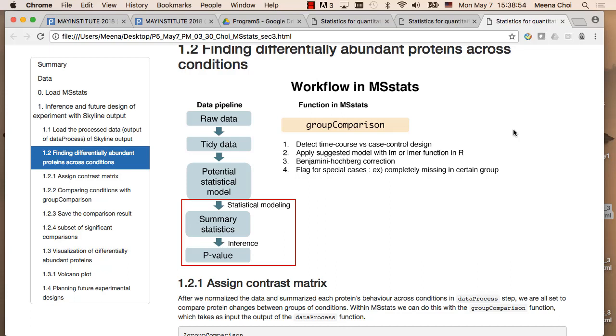So here, we have a condition, and then MSstats says the p-value is 0. We just record 0, which means it looks like something happened, but we cannot give you any statistic number. That is what we say. So we flag this one too. Or special case, no measurement at all.